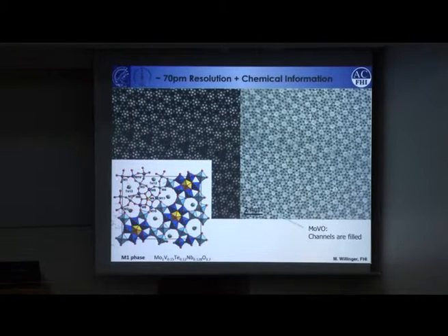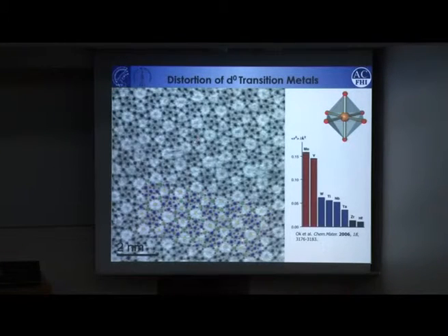you can actually see, I don't know if you see it in the back, probably not, the cations, and zooming in a bit, you can even see the oxygen atoms surrounding the cations. You can, for example, measure the position of the oxygen atoms around the cations, measure the octahedral distortion, and get information about the oxidation state of the central cation. So what I want to say is that with these modern instruments, we can, like Feynman suggested, build a machine, look where the atoms are, and then you understand how this thing works. And with these microscopes, we can do the same.